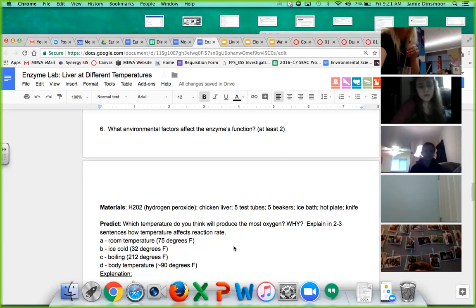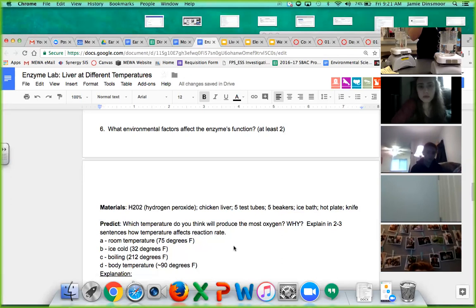I'm gonna adjust this so you guys can see the actual stuff here. So our body temp one is pretty much at body temp. However, the liver is probably not there yet, right? So I'm going to give it just a couple more minutes. Our boiling one, you can already see the water starting to get some gas inside of it, right? It's getting pretty warm here. We're over 50 degrees Celsius for our boiling.